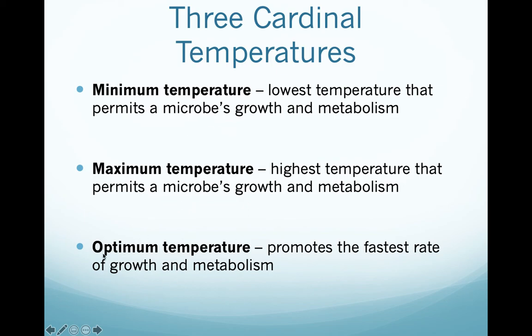It's also nice to know how fast they grow, because if you need to grow them quickly, you can set it at a very normal temperature, the best temperature, or if you've got a little while, you can set it a little cooler and things like that. So I'll show you guys how to read these and what these things mean in just a second.